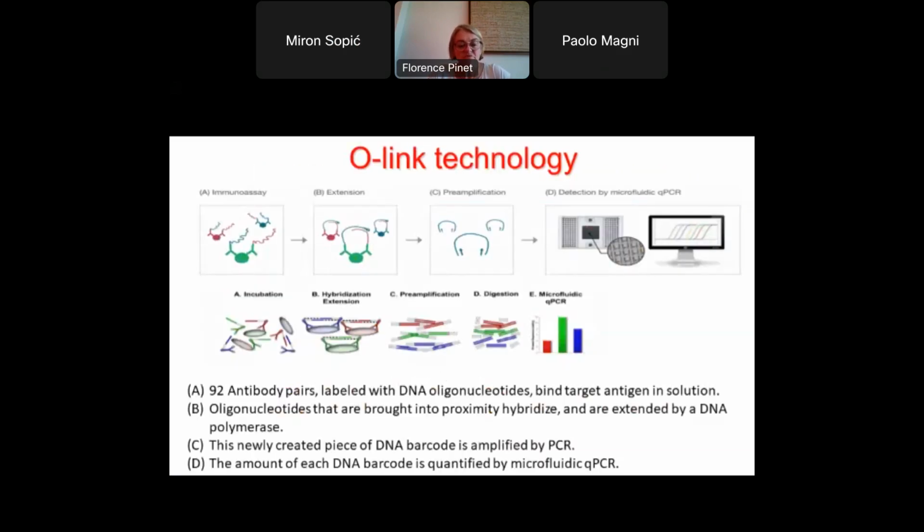So just some words about the Olink technology that I told you uses 2 antibodies to recognize protein.